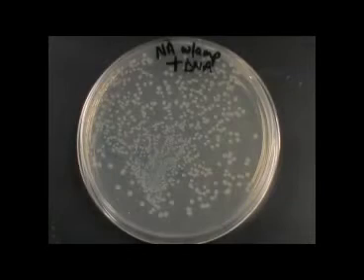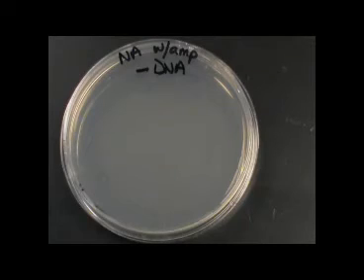Remember, the media being used in this experiment is nutrient agar that has been supplemented with ampicillin antibiotic. For those bacteria that were transformed, they now express the ampicillin resistance gene that is found on the plasmid pUC18 they were introduced or transformed with. The cells that were placed in the control tube were not introduced to pUC18 plasmid. Therefore, there was no DNA uptake or ampicillin resistance gene for expression. These cells should not grow on a nutrient agar plate that has been supplemented with ampicillin antibiotic.